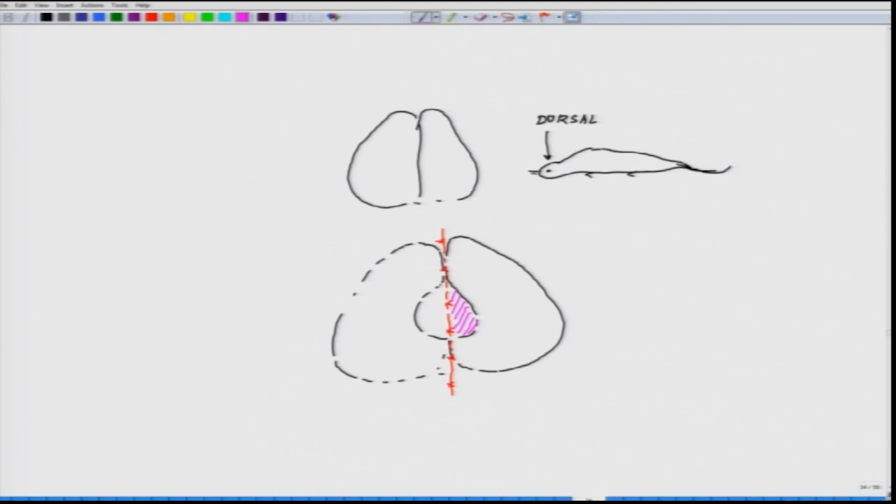So, you have to scoop it out, then underneath this you will see an organ which will be sitting like this, and it is deep inside. Unless you are very thorough with the brain anatomy, it is not so easy to isolate this. This is where the hippocampus is lying.